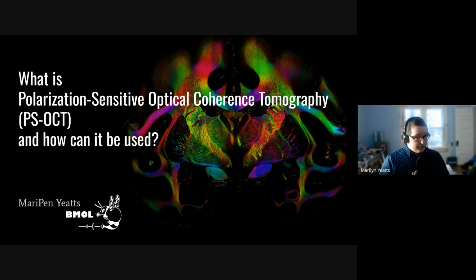Without further ado, I can go ahead and get started on what polarization-sensitive optical coherence tomography, or PS-OCT, is, and how it can be used. In this presentation, I'm going to go over the general basics of what this optical imaging technique is, as well as what I've used it for personally in my lab. So, without further ado, let us begin.